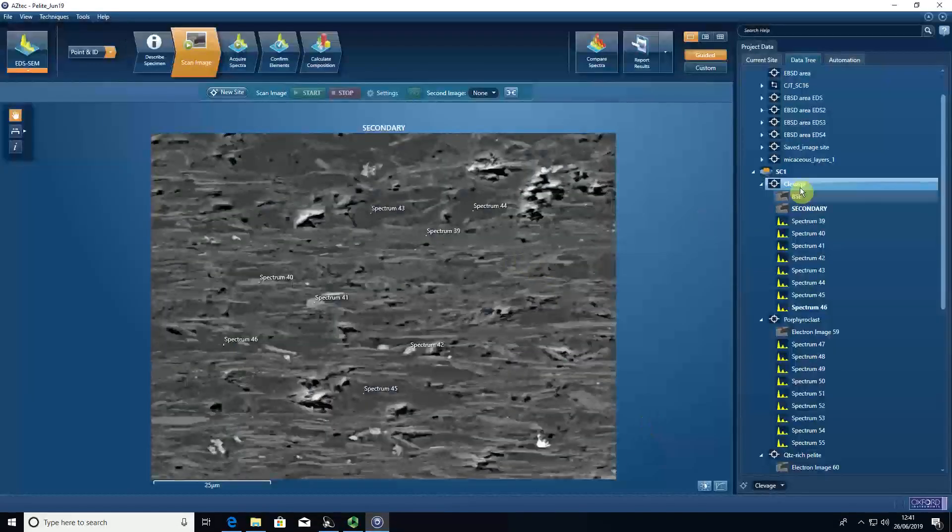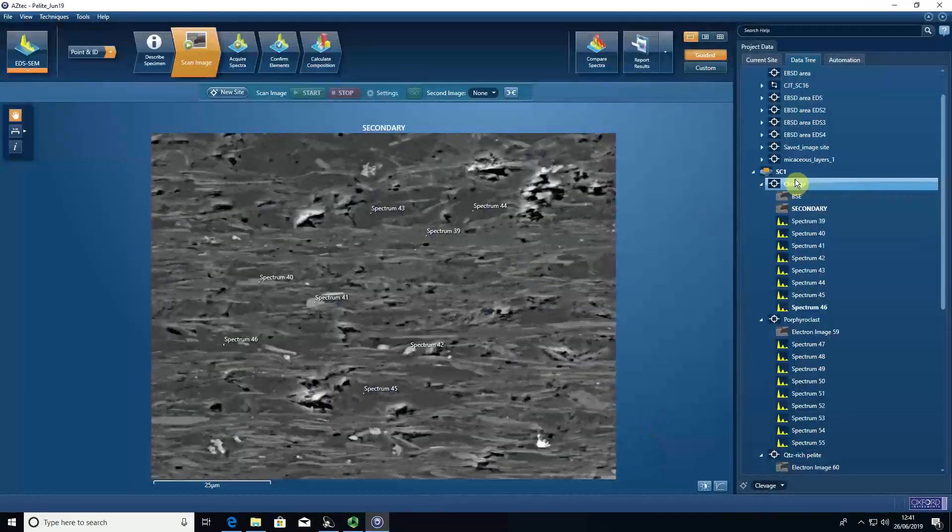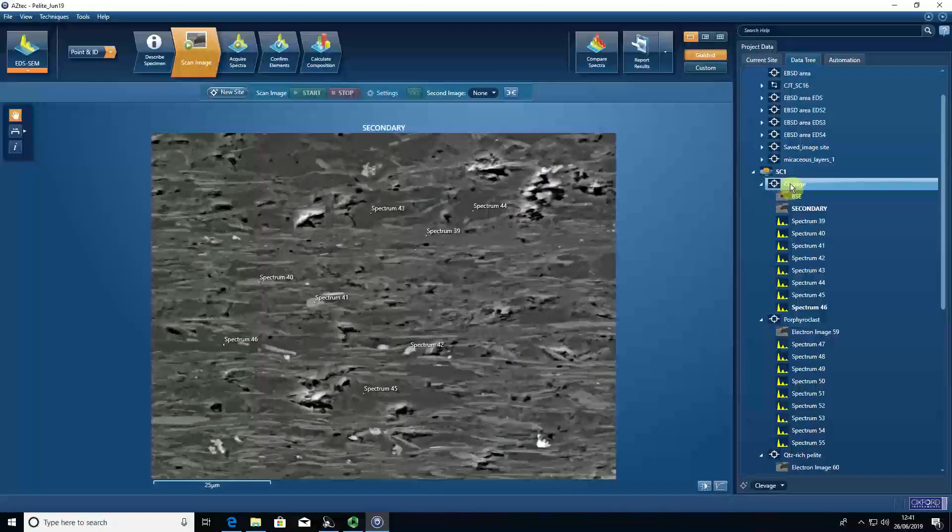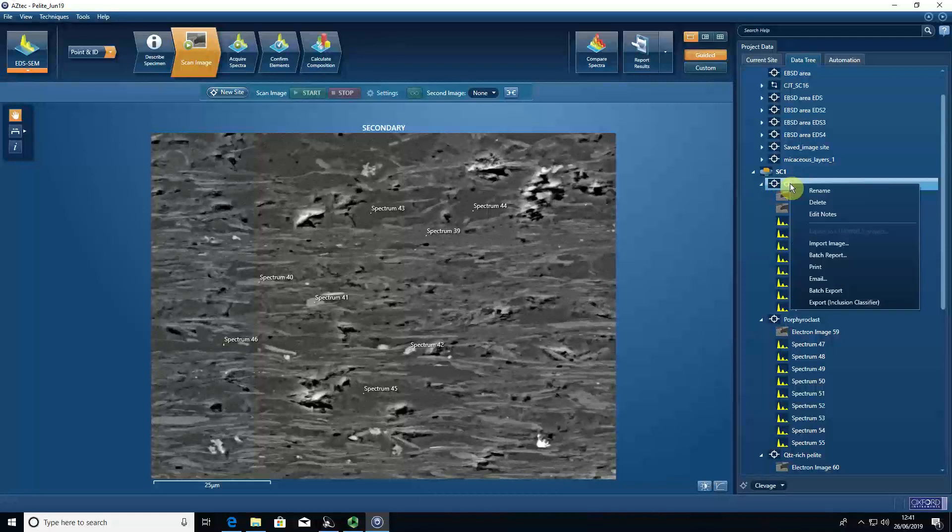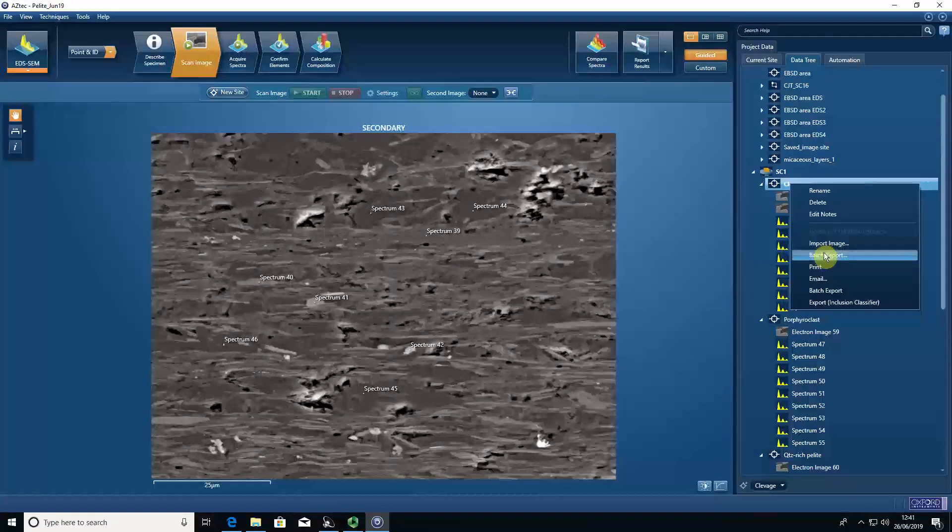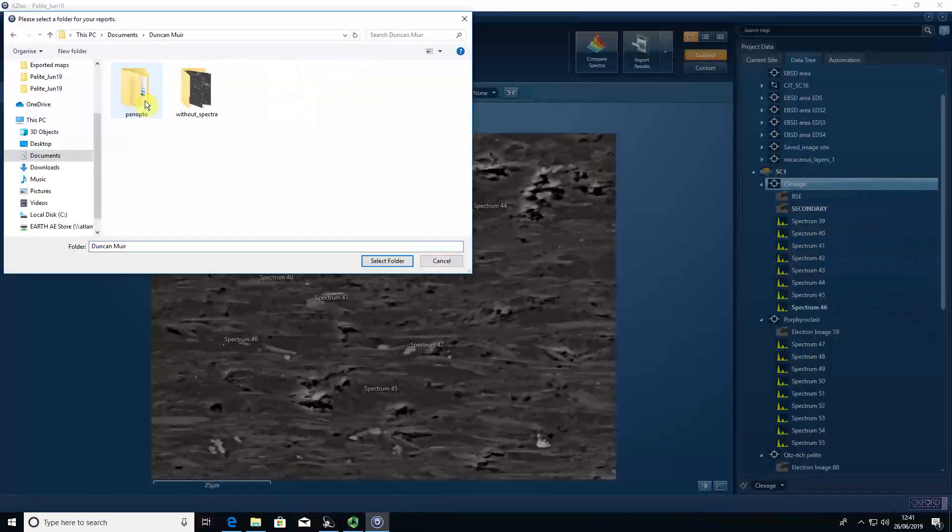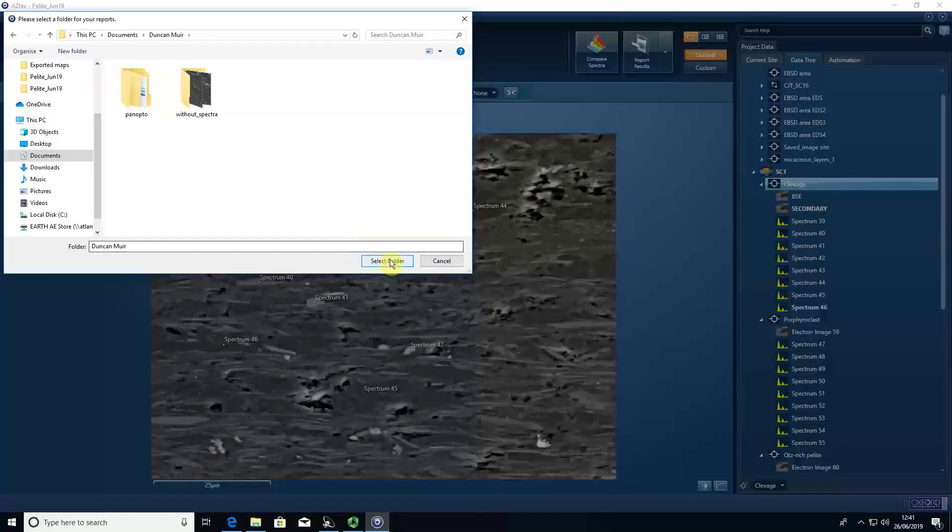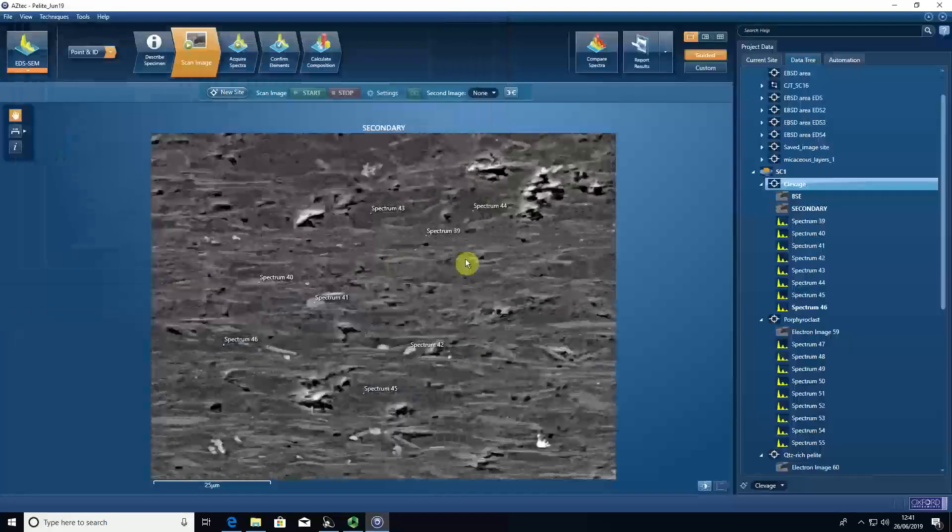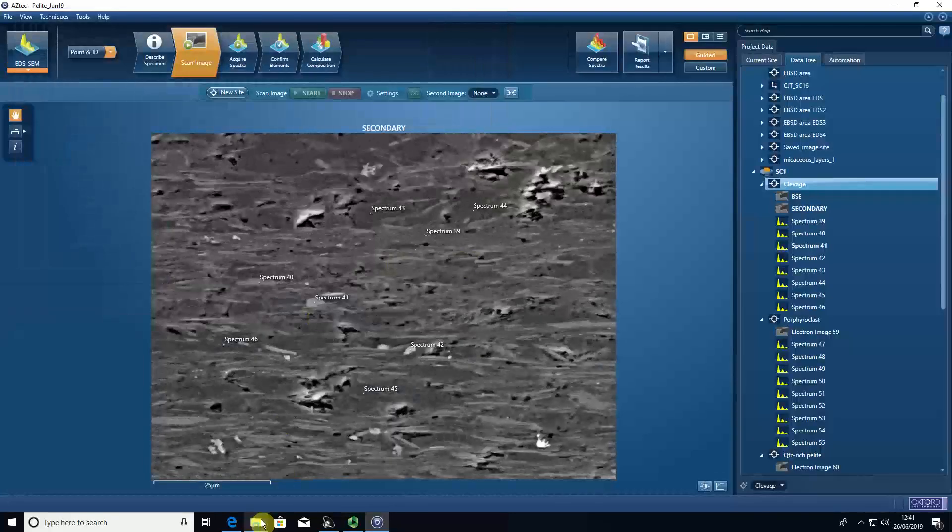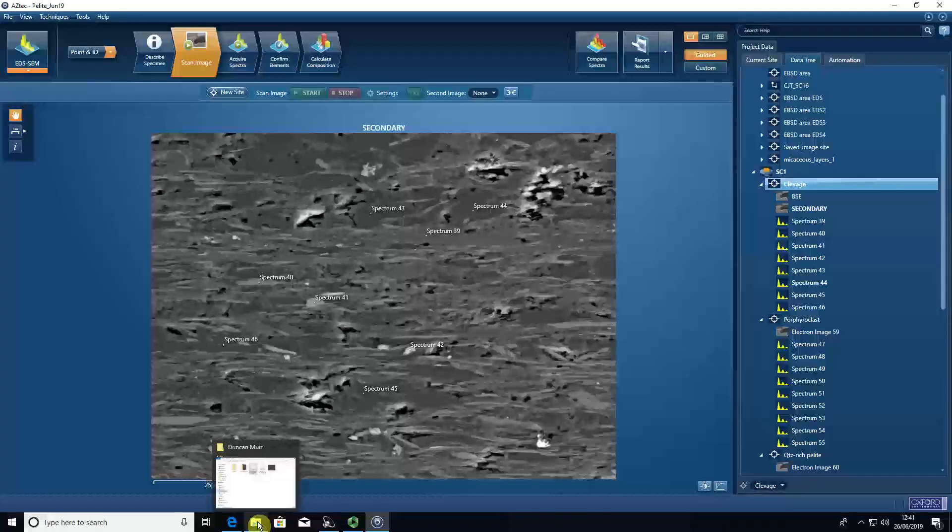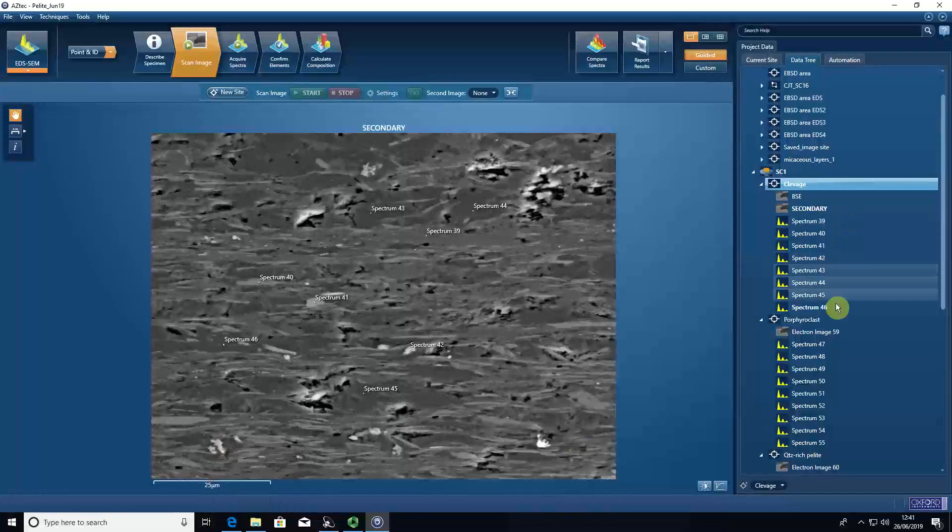And if we then right-click on the site, batch report, select the folder, it will save a new Word document containing each of these spectra.